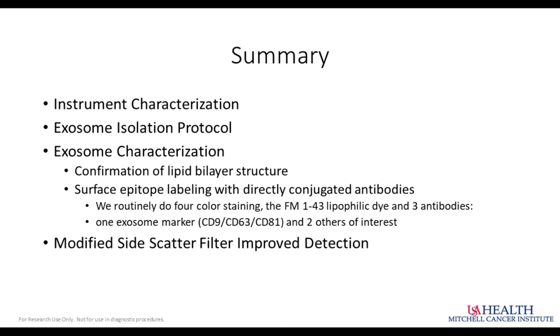So it's, you can't put the cart before the horse. You have to validate that your instrument can actually resolve things in that 30 to 150 nanometer range, and the only way to do that is by using.